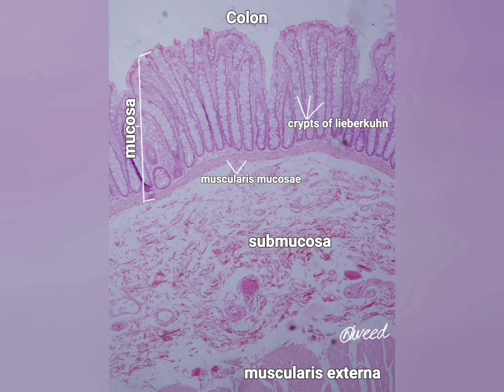The mucosa of the colon has no villi. It is lined by simple columnar epithelium, which contains columnar absorptive cells, also known as colonocytes, and goblet cells.